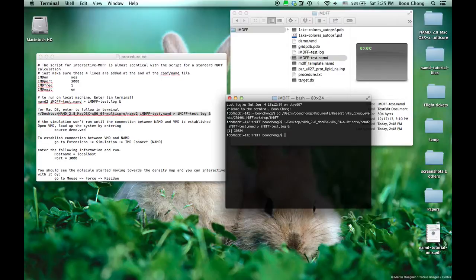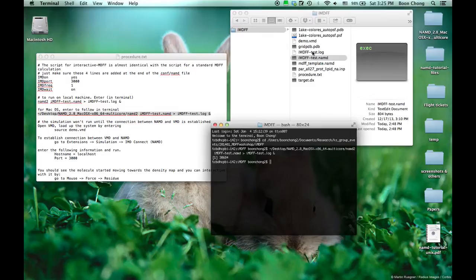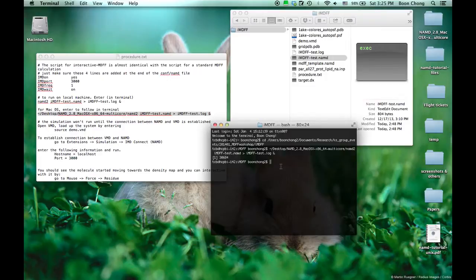You'll notice that there's no file coming out now, only the log file. Because the simulation is not running yet, until there's a connection established.